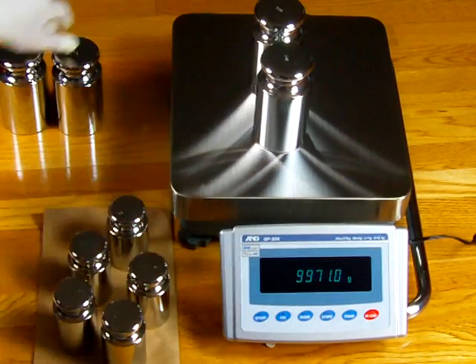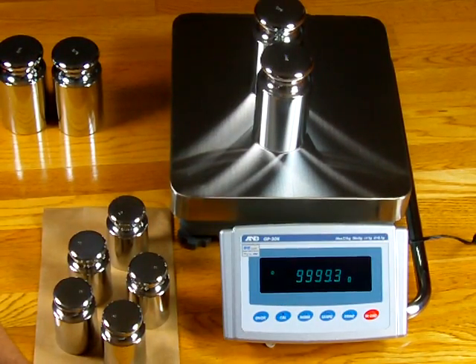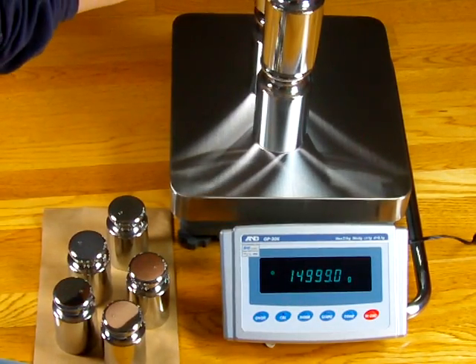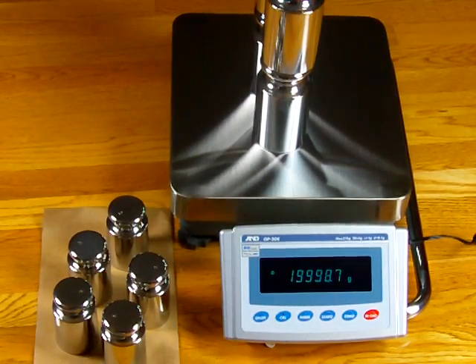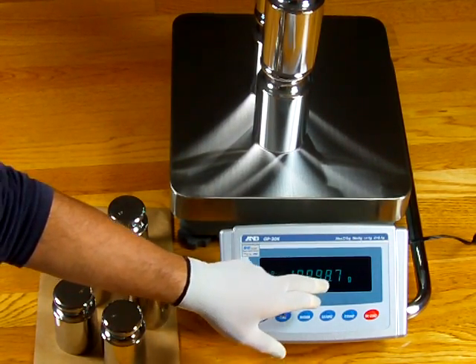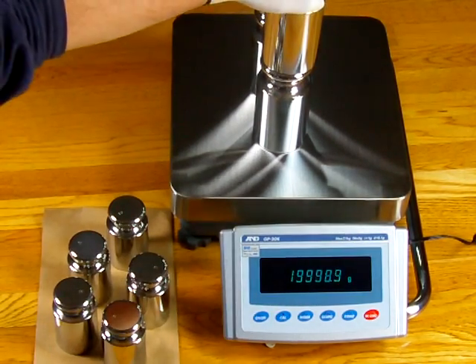Here's 5 kilograms. Even with these low-cost weights — we sell these for about $100 a piece — we definitely recommend buying the external weights if you buy a high-capacity precision balance. If you're an ISO-certified company, you're definitely going to need traceable weights. With four 5-kilogram weights on there — 20 kg total — the balance now reads 19,998.7, so you're off by 13 divisions.